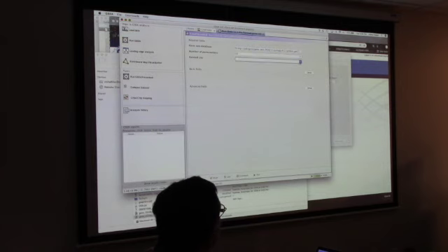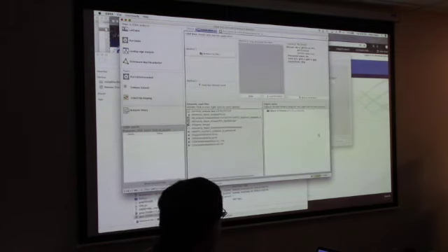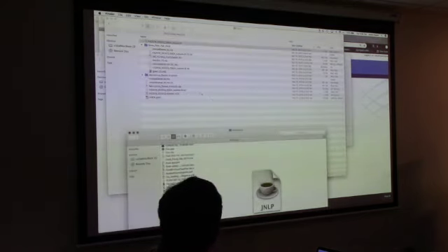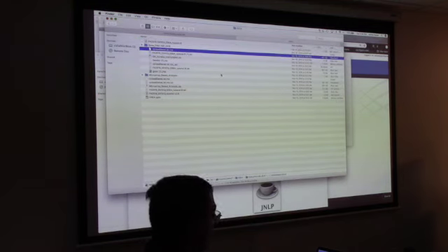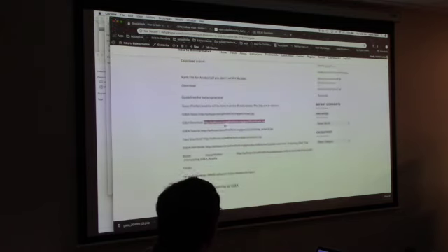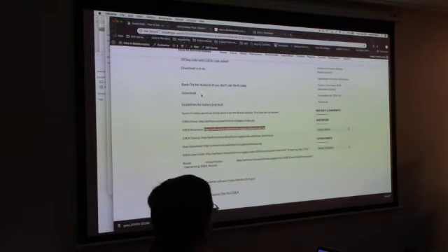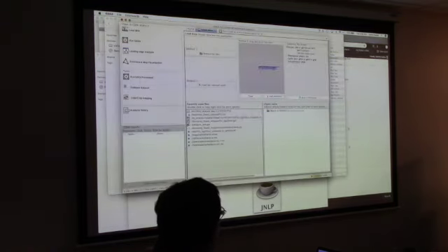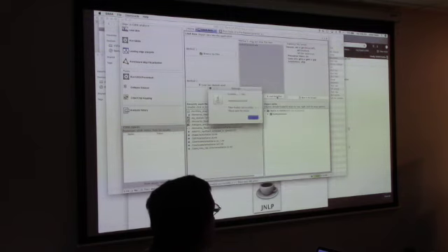Your rank list, this is what you need here. So where do we get the rank list? We actually have to load that. So this is where you go back to Finder and go where your rank list is. Now you can download this from the website right here that I showed you. This is your rank list. It's going to come as a TXT file, so you've got to rename it to whatever, rank list, and then just go ahead and drag and drop here, right? And select load these files. So you should get this. There are no errors. Okay.